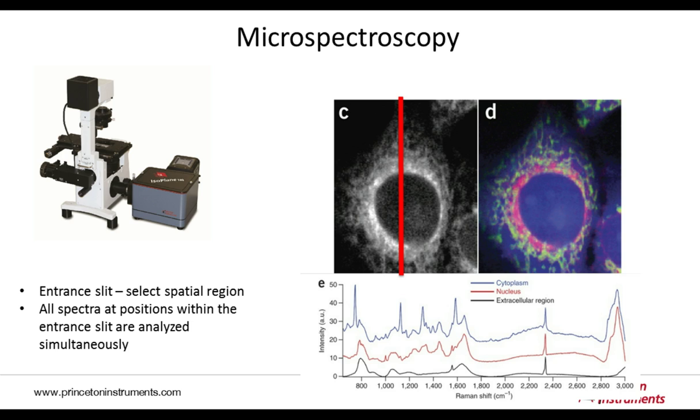From each spatial point underneath the slit, one collects a spectrum simultaneously. Depending on the location and the composition of the cell at each point, there are different output spectra, and by spectral analysis, one can produce beautiful-looking false color images that highlight different functional elements of a cell, for example. So this technique can be very powerful.